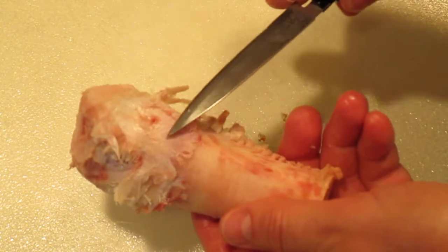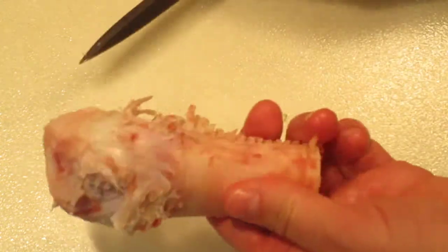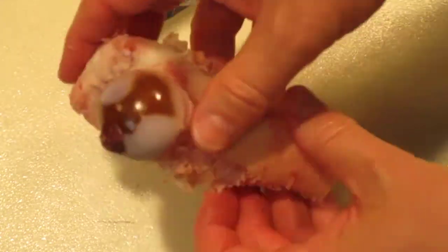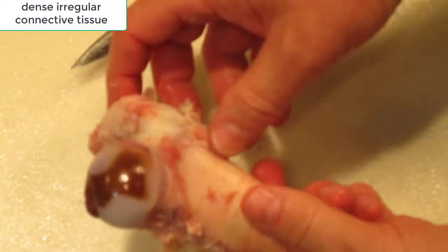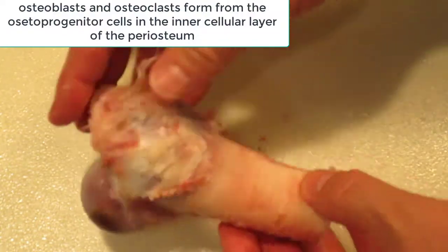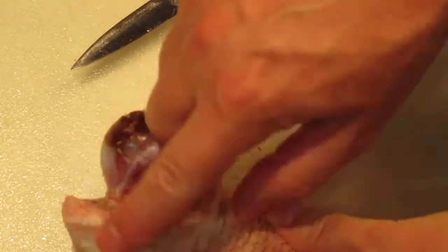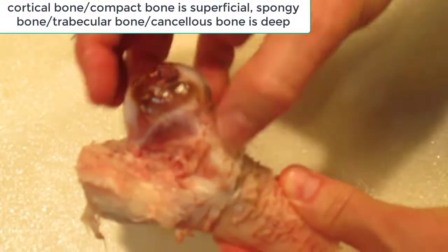You can see the periosteum as I move it back and forth — it covers the entire bone. Underneath that dense connective tissue layer there are some cells that help regenerate the bone: the osteoblasts are underneath there.